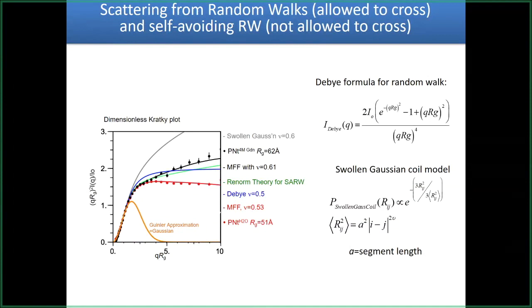Robert has a question from the remote. Yes. In the examples of mixed systems, the fit is often pretty poor. Is there a way to get a good fit accounting for the mixed system? Not that I'm aware of. The way we handle it is by doing simulations.